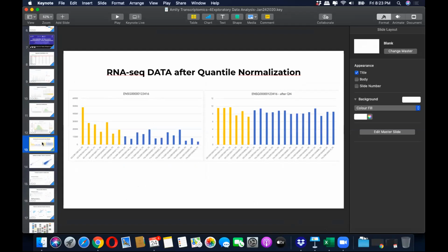Okay, so we have to understand that it is important to remove the noisy data, where from thousands of observations we are reducing to certain observations, and we are looking into individual genes and comparing them.